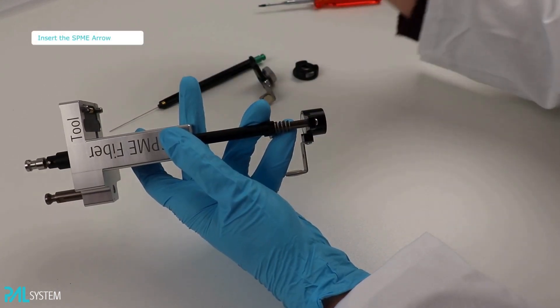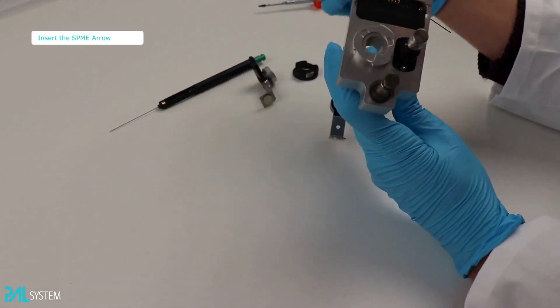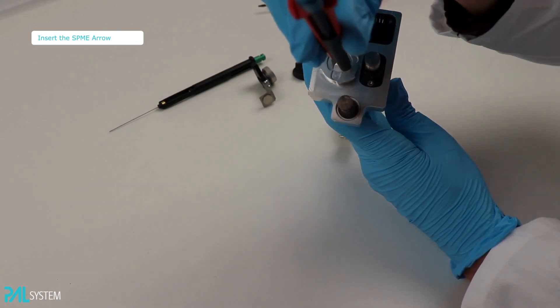Finally, place the 1.1mm SPME Arrow into the tool. Pay attention that the needle is entering the guide smoothly.